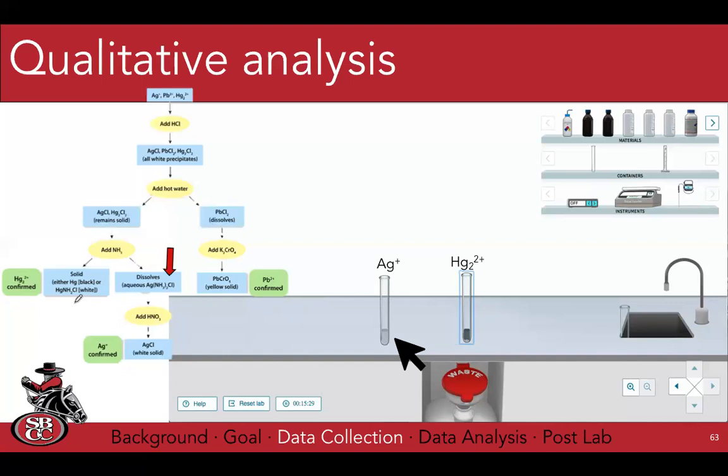Now, again, I've already said the absence of something does not confirm it in today's experiment. We could probably say, well, we think so, but let's think like real scientists. We want to have a binary test for each one of these elements that confirms them, doesn't say that something didn't happen, but says that something did.